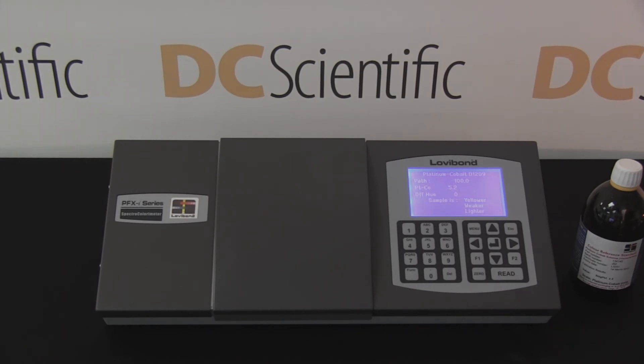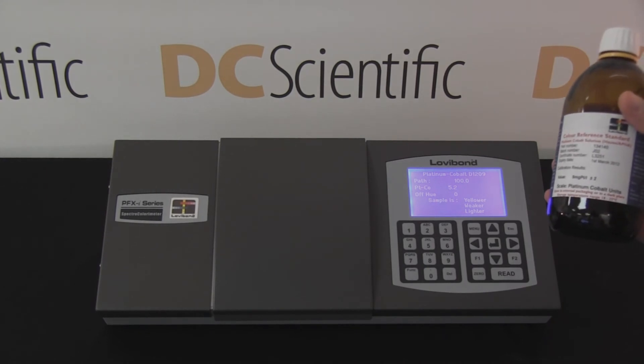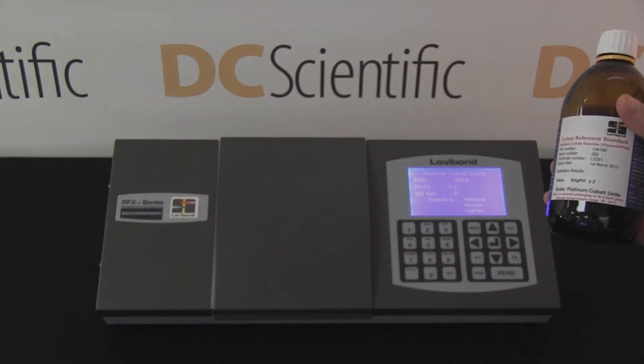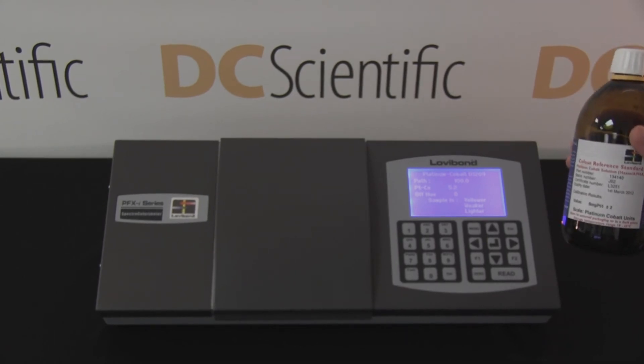The result, a Platinum Cobalt color value of 5.2, appears on the screen. The technician then checks the result against the ISO 17025 certified reference standard.